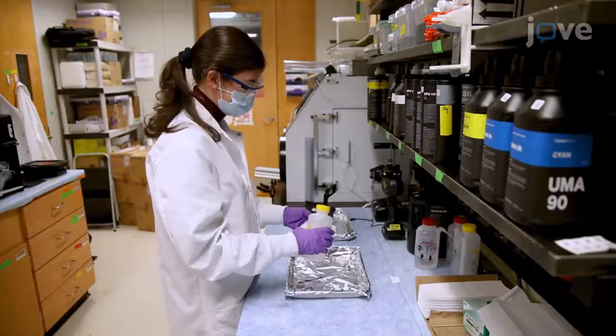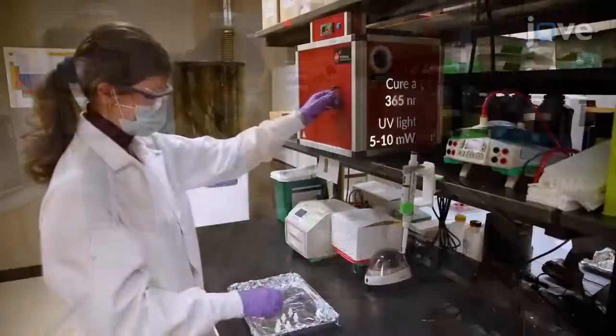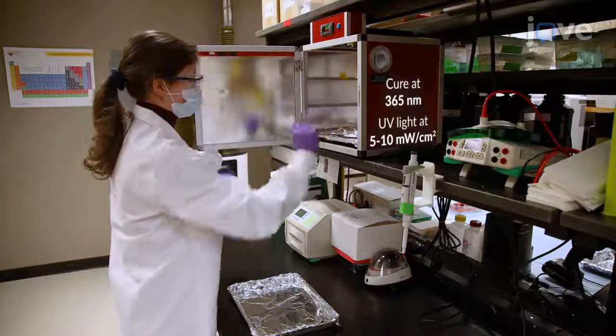Then wash the parts printed in hard resin with the alcohol to remove any excess uncured resin and cure the parts in a UV oven for 1 minute per side.